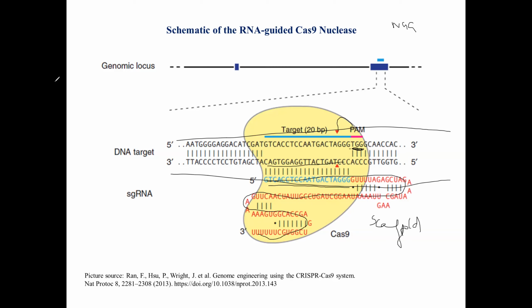So these are all potential PAM sites. There may be multiple places where you can see PAM sequences, because the possibility of seeing NGG, two guanines together, is quite high. Every 10 to 12 base pairs in the DNA, you can see an NGG.